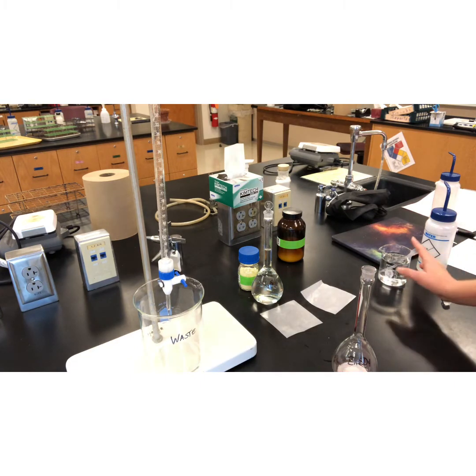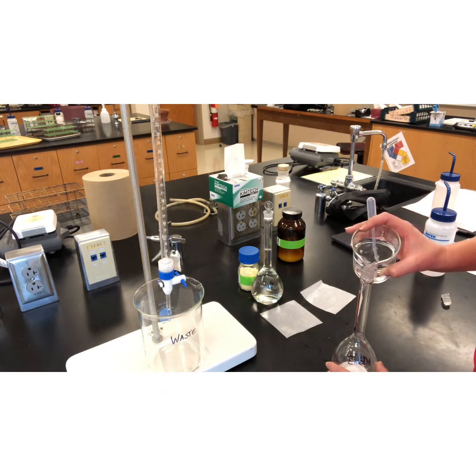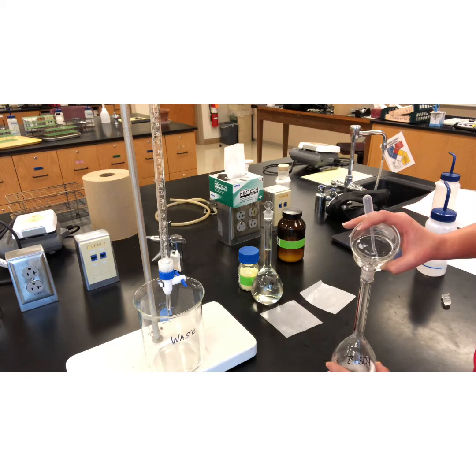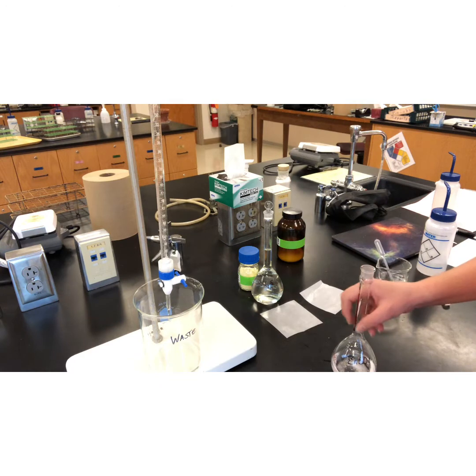Do the same thing, adding DI water and then swirling to dissolve, and then topping off my solution. So you have the solid, you add some water, you swirl to dissolve, and then you top off the solution.